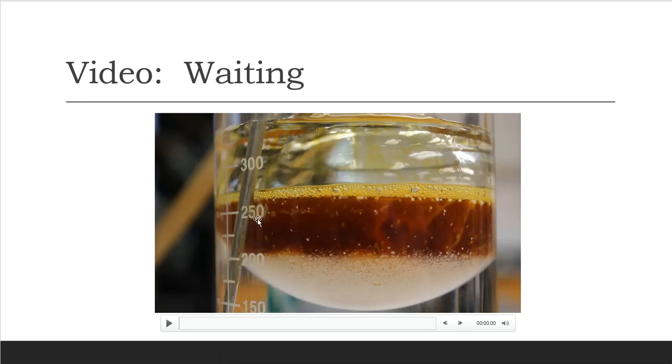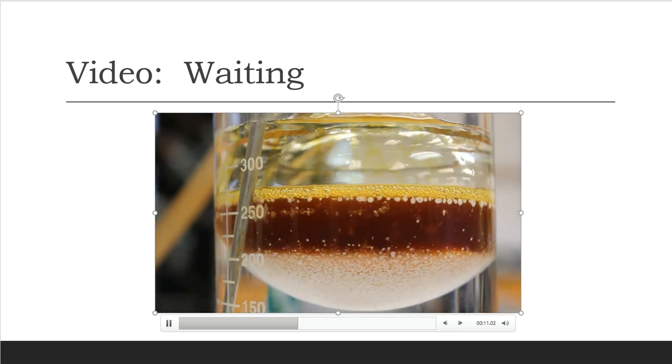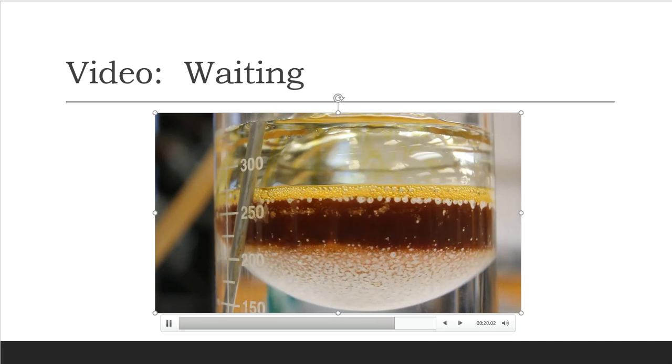All right, I begin to wait. So here's a couple of videos throughout that waiting process. All right, so clearly you can see what's happening at this point. All of these observational changes have to be documented in a laboratory notebook. It's very important. So again, the addition of hydrogen peroxide right here. And I'm still waiting on it bubbling and calming down a little bit before I go on to the next step.